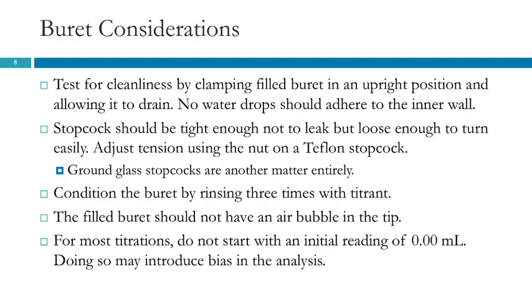You want to make sure your stopcock is working properly. It needs to be tight enough that it's not going to leak, but it needs to be loose enough that you can turn it easily. And so there's a balance in the middle there. We have burettes with Teflon stopcocks, and so there's a nut, and you can adjust that.